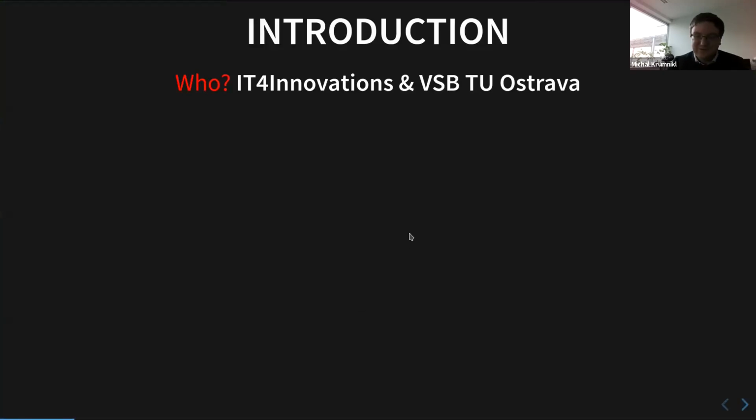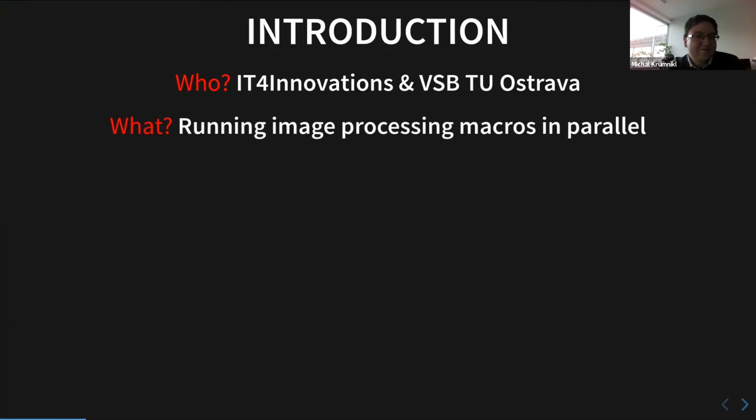Okay, so now we know who we are. So I'll tell you what is ahead of us. Our tutorial will teach you how to run your image processing macros and scripts remotely on high performance computing infrastructure and try to fully utilize its parallel capabilities.